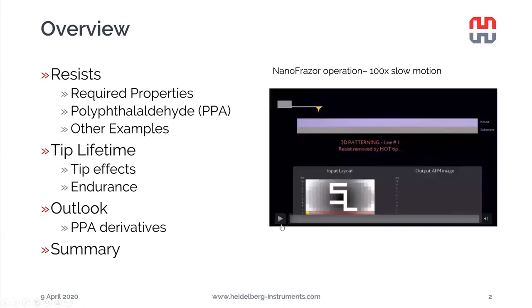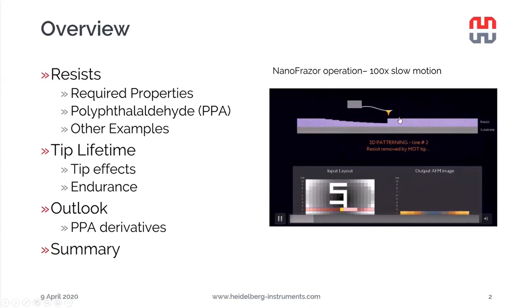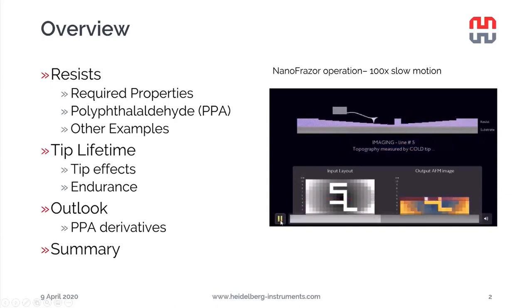So we start off again with this nice video that most of you probably have already seen of the function scheme of the NanoFrazor, where we write with a hot tip into our resist and we read back the written pattern with the cold tip. We have this grayscale image as input that corresponds to the depth levels that we pattern, and with the cold tip we create an AFM image. We will now focus on what's going on with this blue stuff here, the resist.